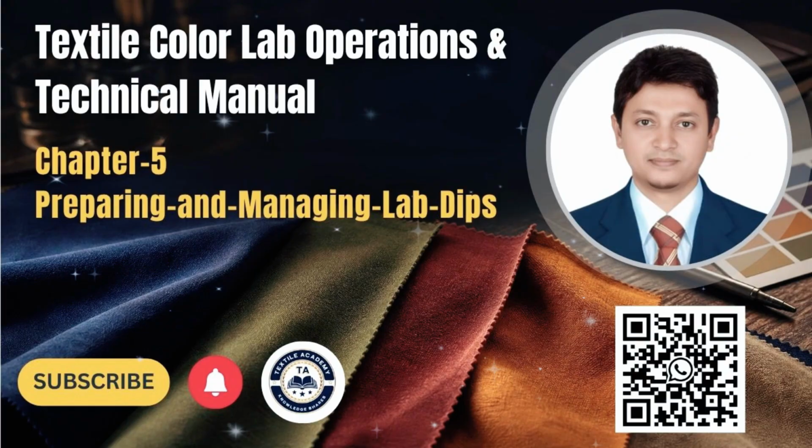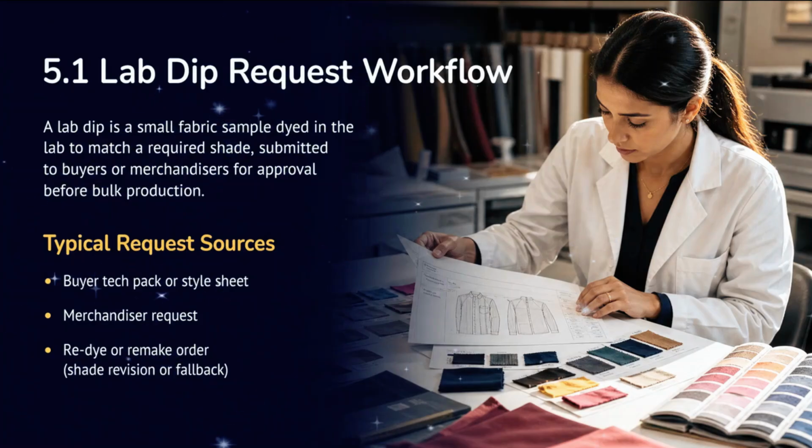Welcome, everyone. In this session, we will focus on Chapter 5, Preparing and Managing Lab Dips. This guide offers color lab managers best practices and practical tips for handling requests and achieving approvals. Section 5.1 covers the lab dip request workflow.